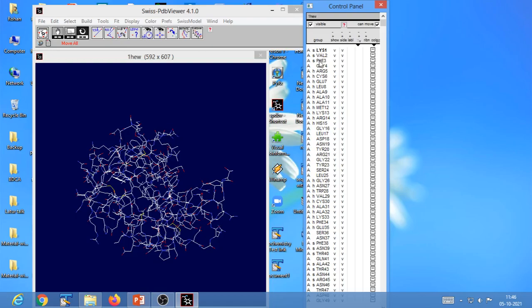Okay, so now selecting the amino acid residue will not change what is shown on the display menu, or what we call the graphical window. Whatever you select, the actions that are taken on the model would affect only the currently selected groups. That is the difference. When you select the amino acid residues in your control group, it won't change anything over here. But if you take some action, that action would be carried out on only the selected group.